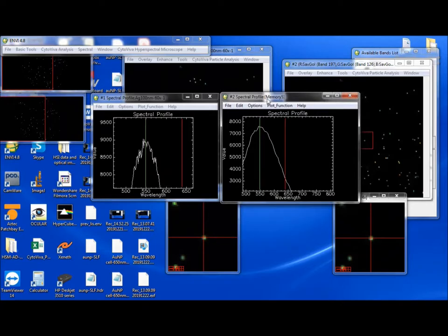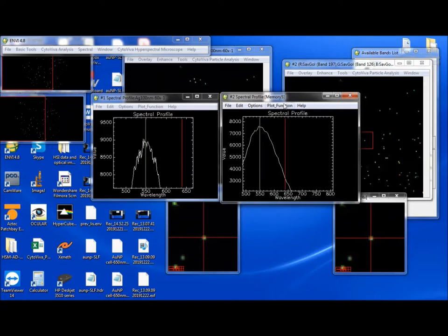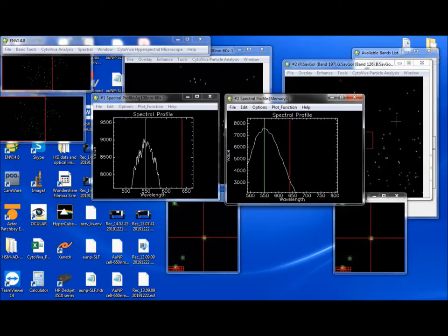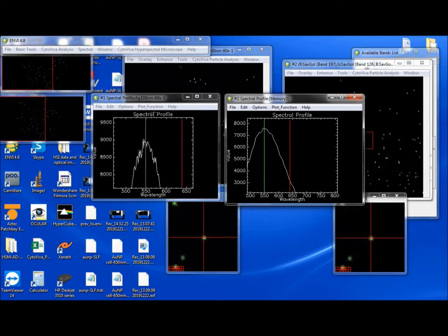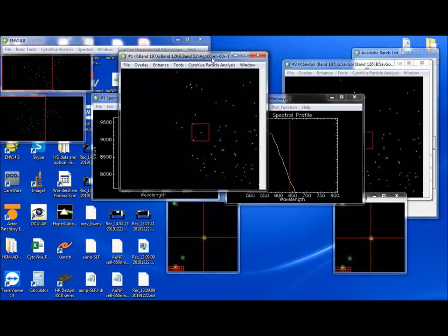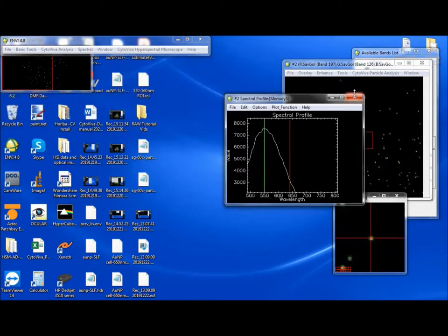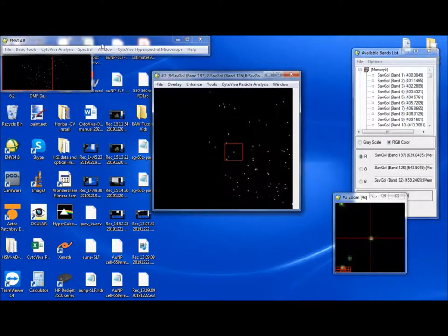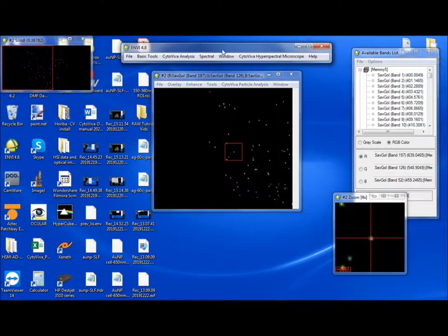I don't think there is a better way. If there is, please let me know. I'd like to know. But when I've done smoothing on both of these, or when I've done spectral mapping on two processed and unprocessed files that are smooth, I really don't see any difference in the mapping. Some people might argue that the smooth data is going to be easier to map. It's going to be better. Some people would probably say that maybe this is more accurate because these little inconsistencies matter, but that's up to you to decide. Typically, I don't use the smoothing algorithm that much, but it is a tool that's available if you need it.